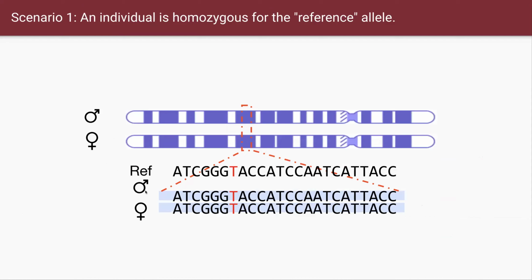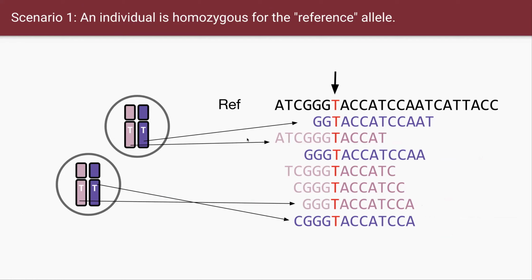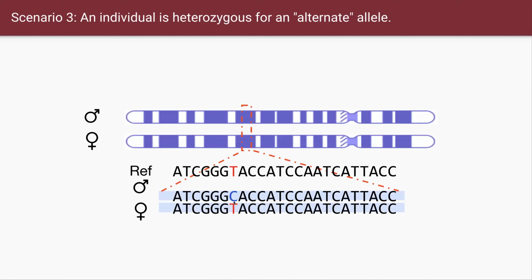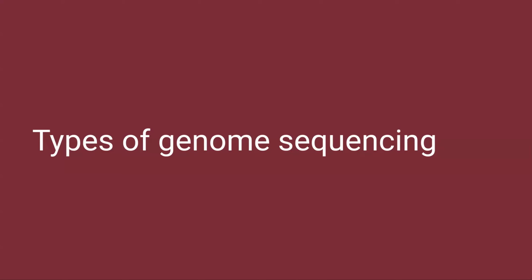So if you look here, a dad and mom give you reference alleles, and that information is converted into base calling data like this. If you look at a position, you have many reads covered by either your mom or your dad, right? And that information looks like in here. If you have a homozygous genotype, CC, that information is also mapped like in here. And if you have CT heterozygous information, that will be like in here, right? Okay, and this is basically how base calling works.